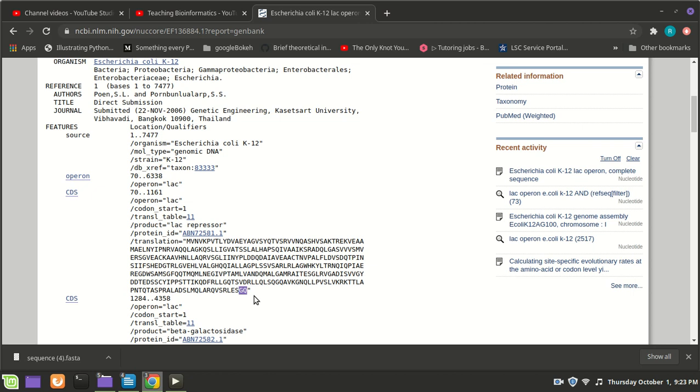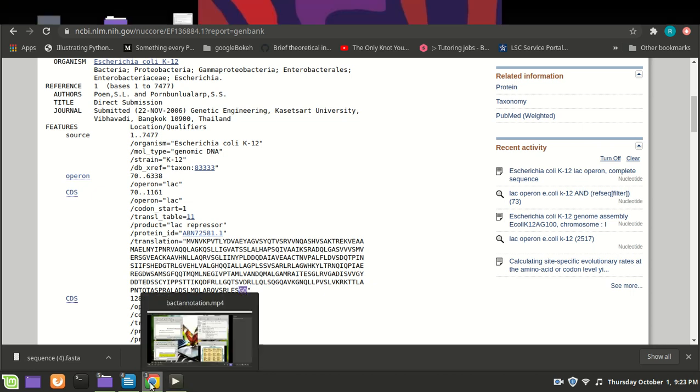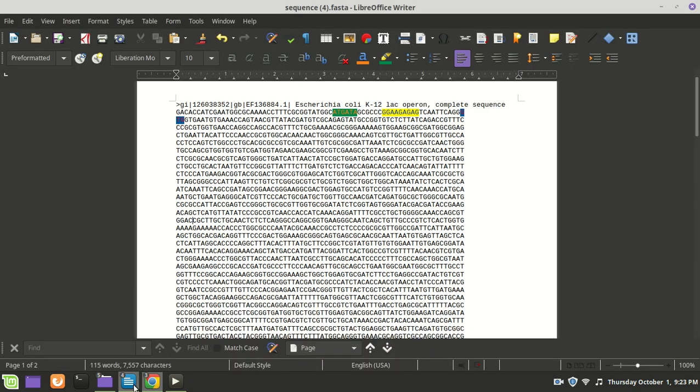I don't know what that is. It's probably a glycine, and I don't remember what Q is. You would find the potential DNA sequence. Remember, multiple codons, so there are lots of them. There might be several here that could potentially code for this, and you would look for it down in this region. So we're a little over 1,000. Somewhere in the next few lines here, you're going to find a sequence that could code for G and Q.